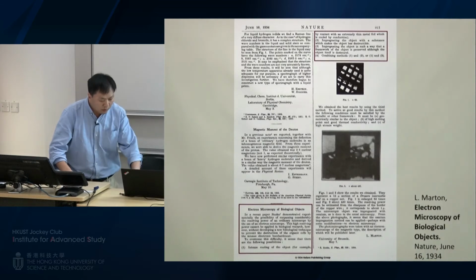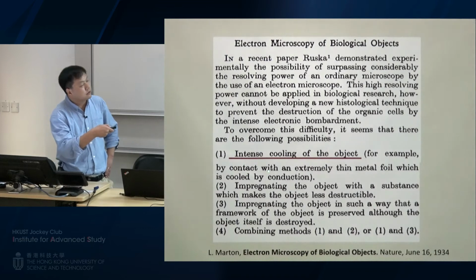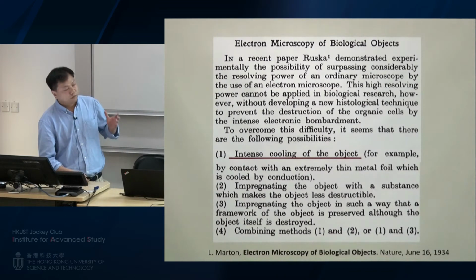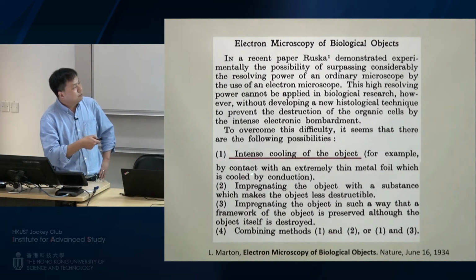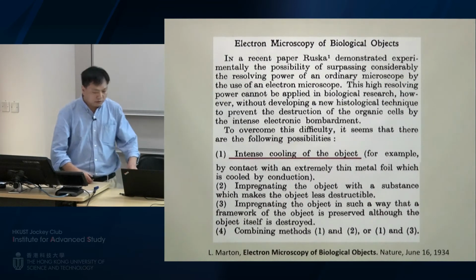important. So one solution is that if we can cool down the biological samples, then we can minimize the radiation damage. Another good thing about the cryo condition is that the sample will be frozen in a near native state. That means we can get a structure which represents the native structure.